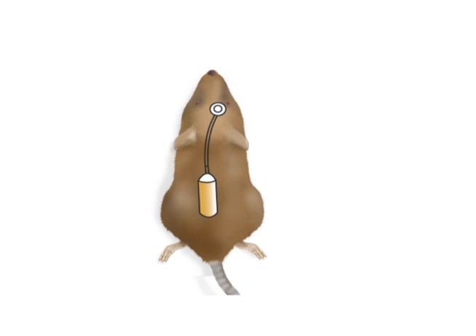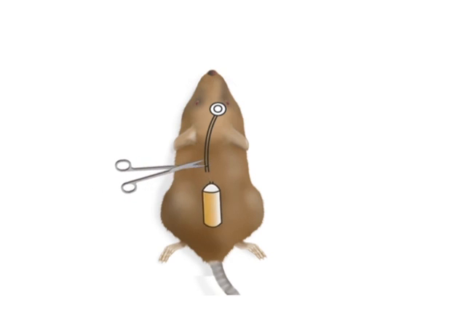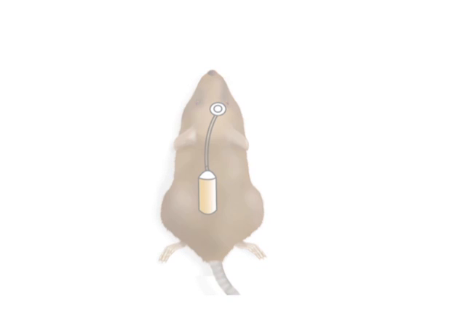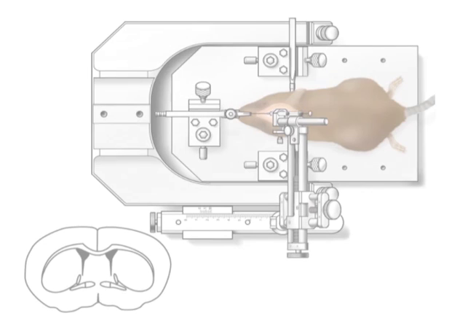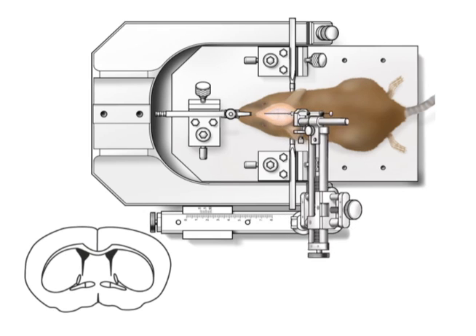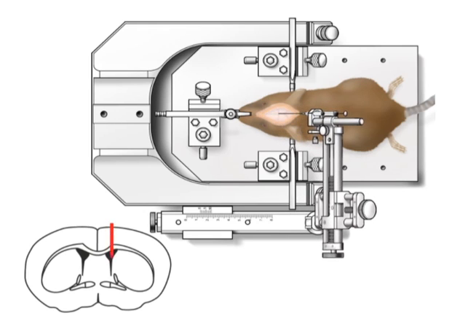Once the pump has finished delivering the drug, the pump can either be completely removed, which allows the cessation of treatment, or replaced, which allows the continuation of active treatment. The second method to deliver drug relies on a single bolus injection into the right lateral ventricle. A set amount of drug can be rapidly flushed into the entire central nervous system using this method.